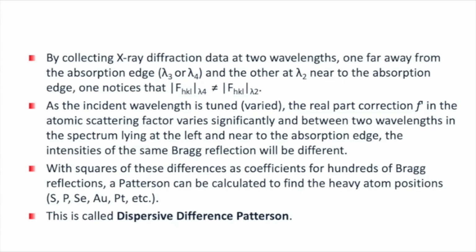These are known as edges, left edge, right edge. So in synchrotron, before the sensitive detectors came to measure the differences, people used to measure three data sets. One is your anomalous scattering data, set at f double prime, where the intensity of HKL and intensity of H bar, K bar, L bar will differ.